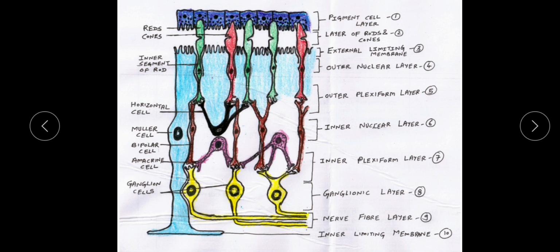So whenever the histological slide of the retina is prepared, it detaches from the remaining 9 layers of the retina and remains attached with the choriocapillary layer of the choroid. So you will not find it in the slide of the retina.